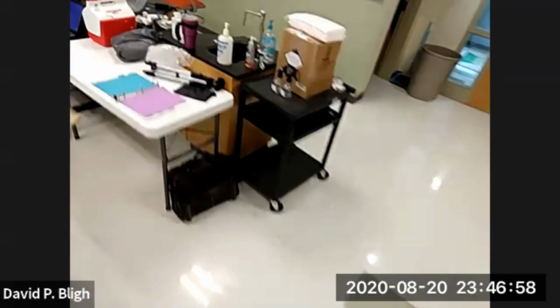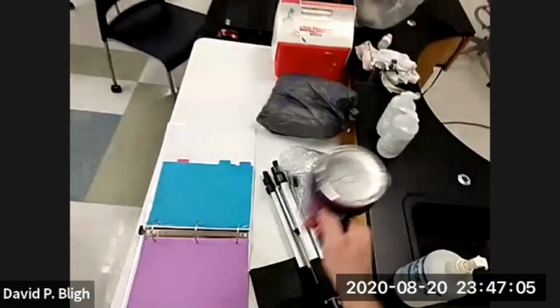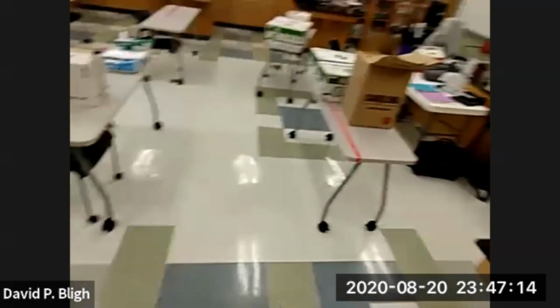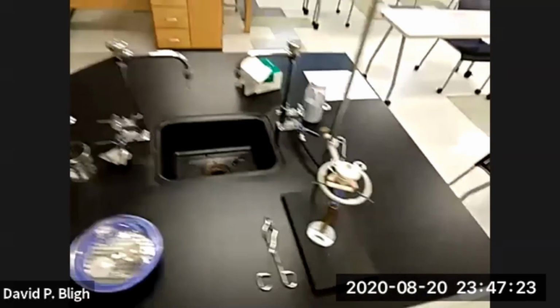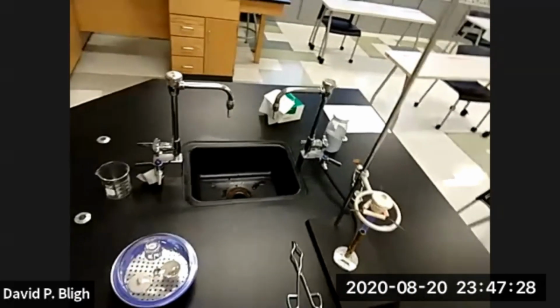All right, while we're waiting, I'm going to smoothly give myself a drink. Now, I just did something bad. I have a drink in the lab. I'm the only one in here, and my drink is 20 feet away from my work area. So under these circumstances, I think we're safe. Although, technically speaking, it's the wrong thing to do.